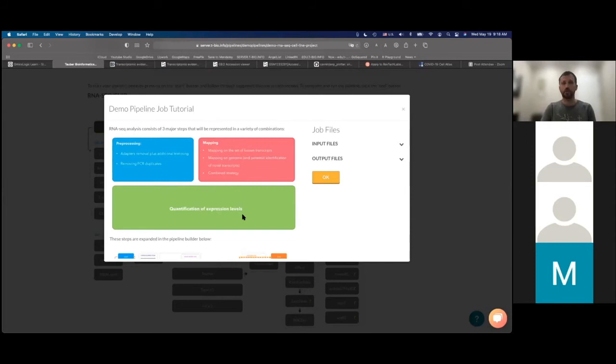Pre-processing. So when we generate those digital reads, and those reads are in abundance, we know that they have been prepared using library preparation techniques. In other words, there's adapters, short sequences that are used when those reads are generated. So that's problem number one.